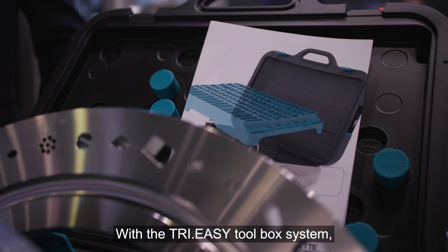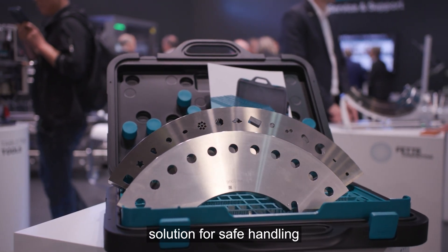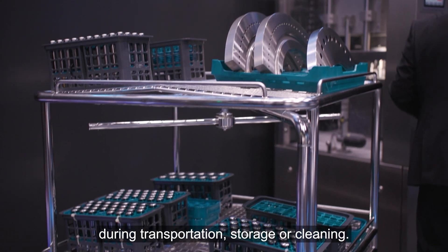With the Tri-Easy Toolbox system, you get a proven user-friendly solution for safe handling during transportation, storage or cleaning.